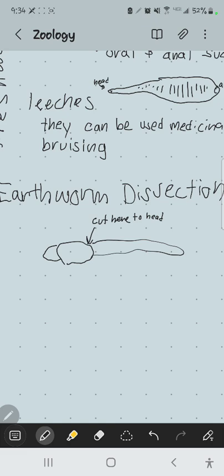Pin it off like maybe a quarter of the way to the edge. That way, if we do use a dissecting microscope to look at the structures, you can get in there and move it around and see things. But these days, cell phones are so good that they magnify and have sharper images than pretty much almost our dissecting scopes do. So I think you can see everything you need to see by using your cell phone, zooming in on the structures.